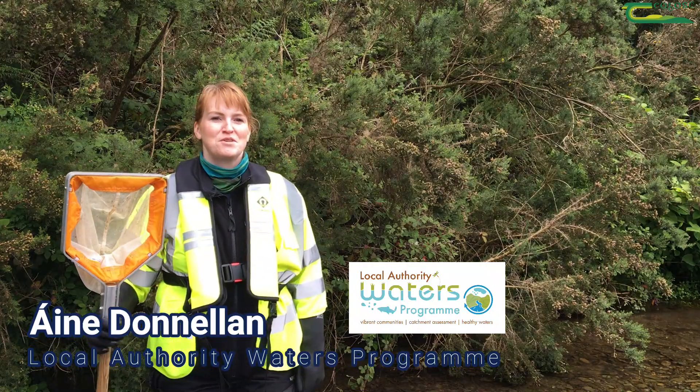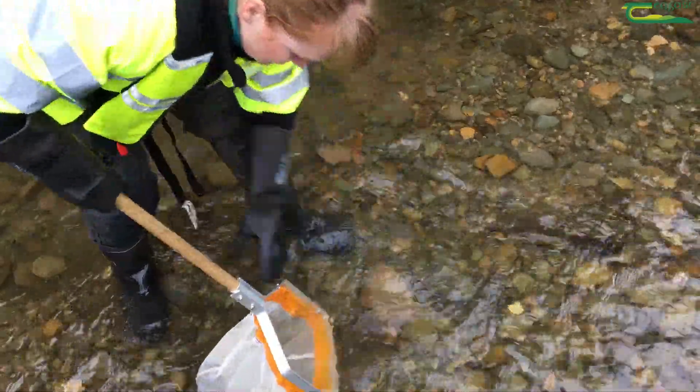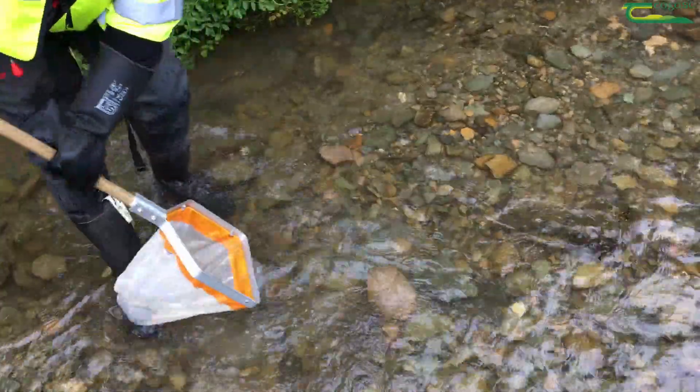Hi, my name is Anya Dunlin and I'm working with the Local Authority Waters Programme. Today I'm doing a kick sample on the stream to check the water quality.